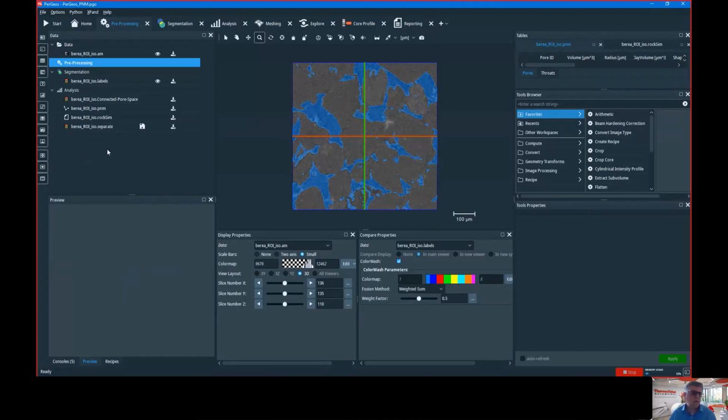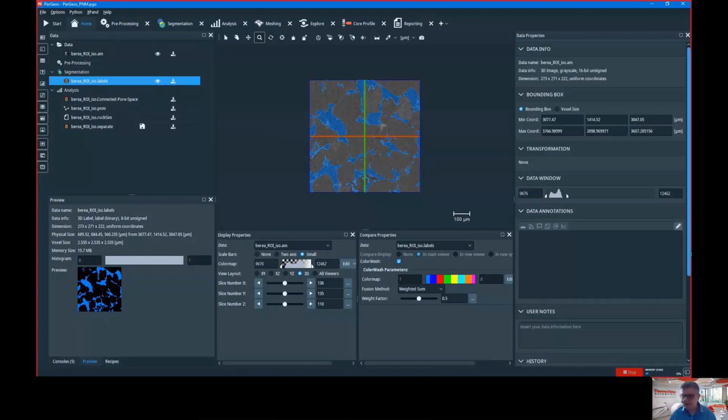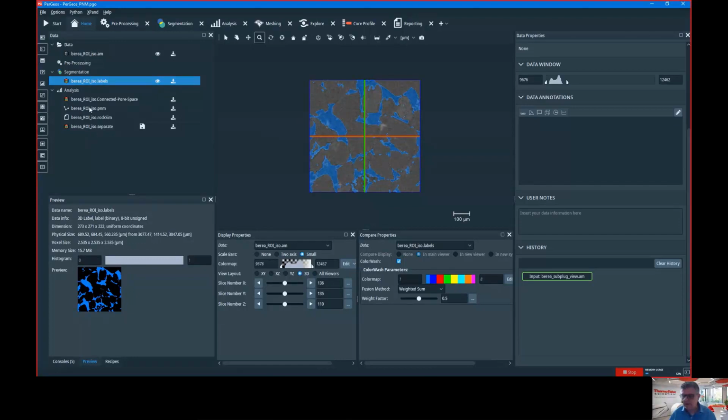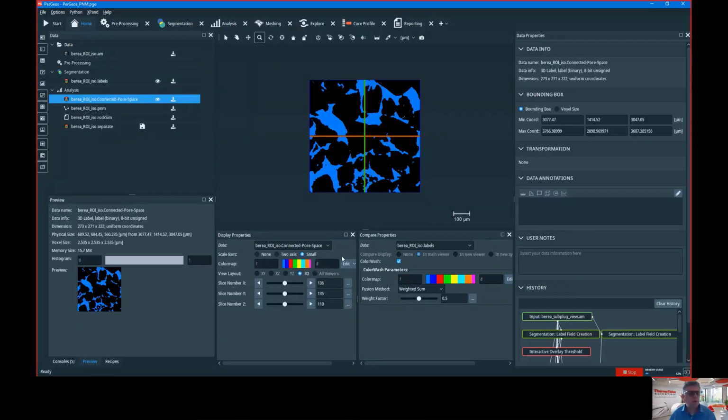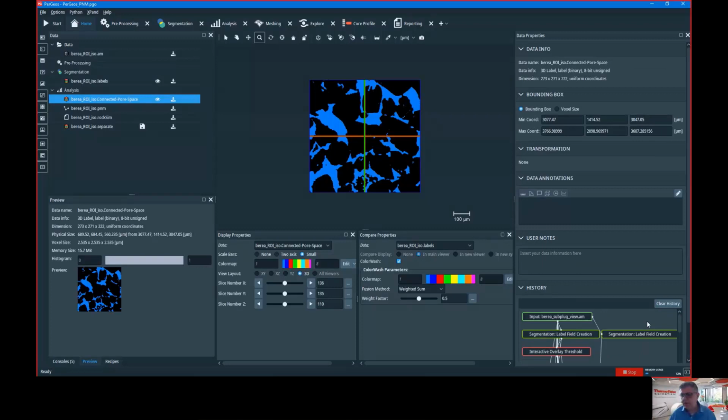Of course, there is the network, but it's not visible. We still keep the history. Every object that is here has been computed through a workflow. So this workflow is the network, and we keep it. It's not lost. So for example, if I double click on this, you see it's here. So indeed, the sequence of steps that has been necessary to arrive here are stored somewhere.